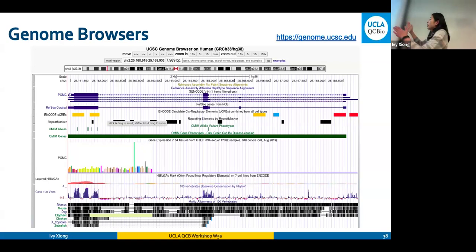For example, in this region, I have a very abundant read. What could potentially be regulating it? Usually the acetylation data means that the whole region is acetylated, so it's actively transcribed. If it's methylated, it can be an enhancer region, or it can be a repressed region, etc. So these are all information that you load in. Yeah, you can load it as you want.